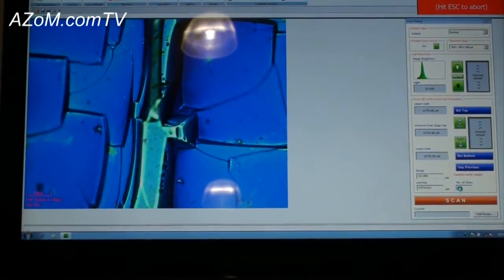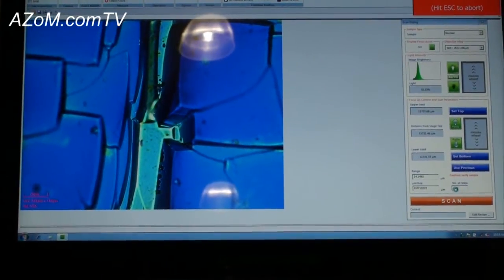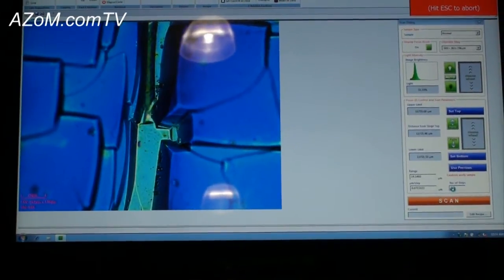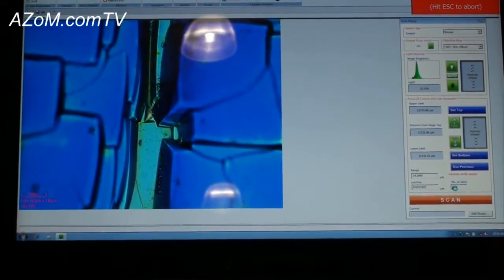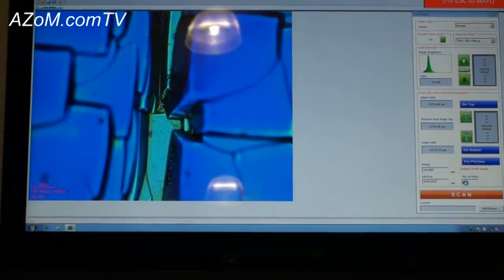We actually take that full field of view image at each location. At the end we'll have the results which will give me a profile across on the upper left.